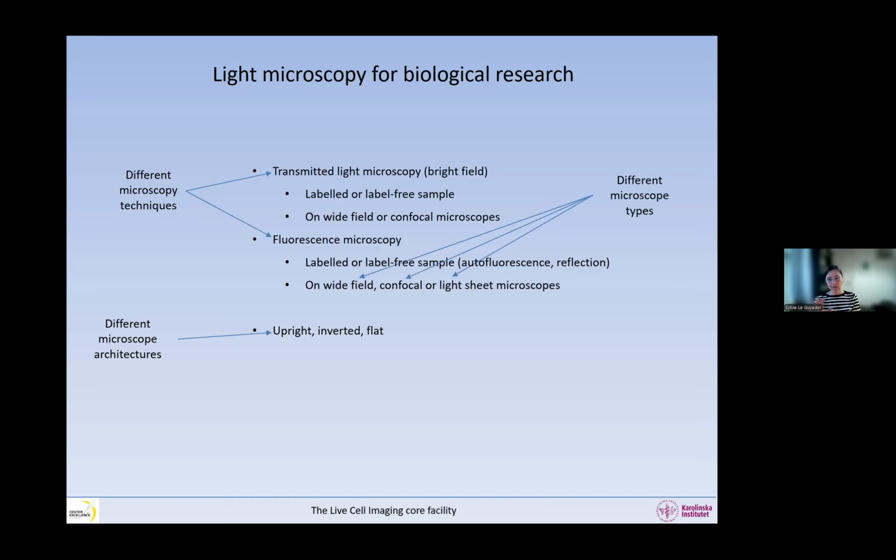I think my lecture here is going to explain all this, and hopefully it makes sense at the end. One thing that I want to point out immediately is wide field and bright field. Often people may confuse them, they sound a bit the same, but they're actually very different things. Bright field means that we have a dark object on a bright background. This is what we do when we use transmitted light imaging. So the background is lighter than the object itself.